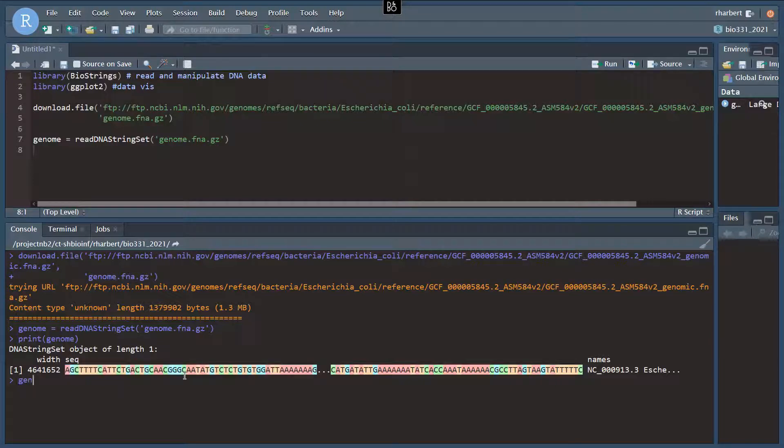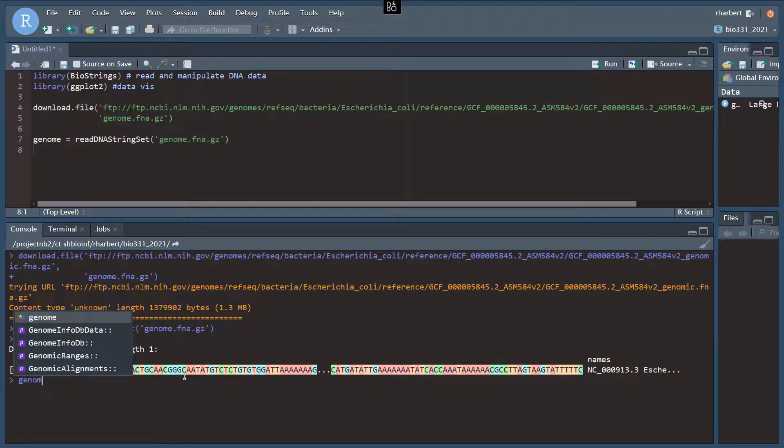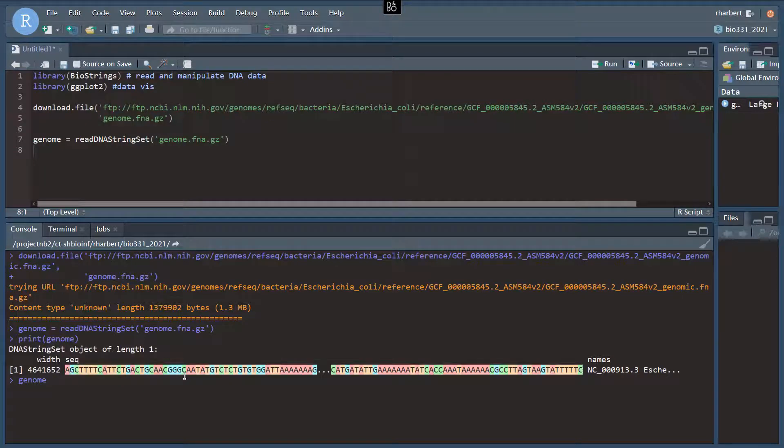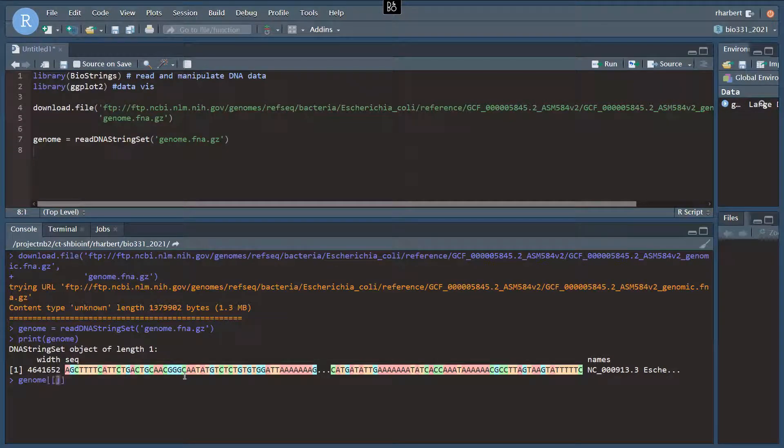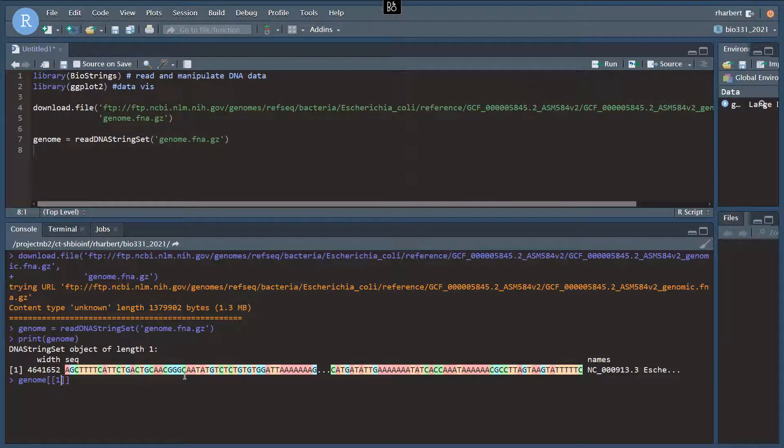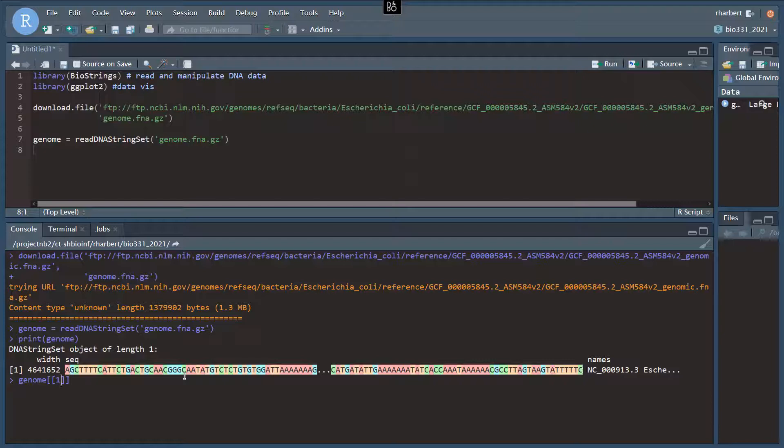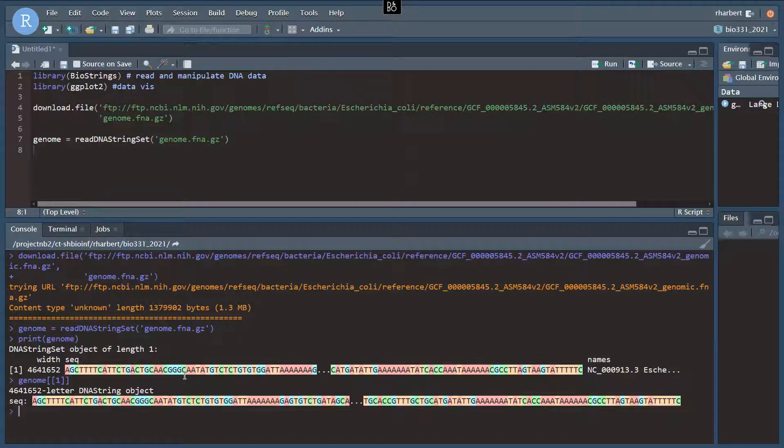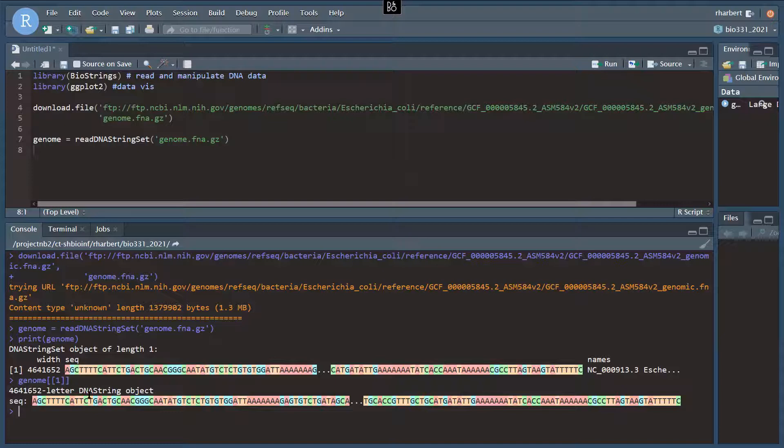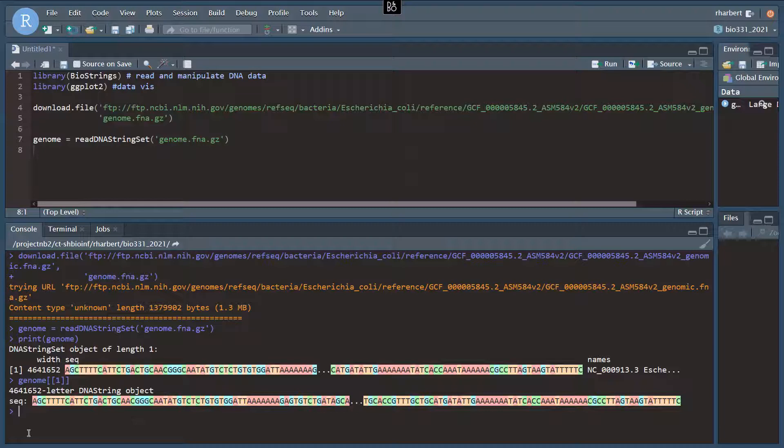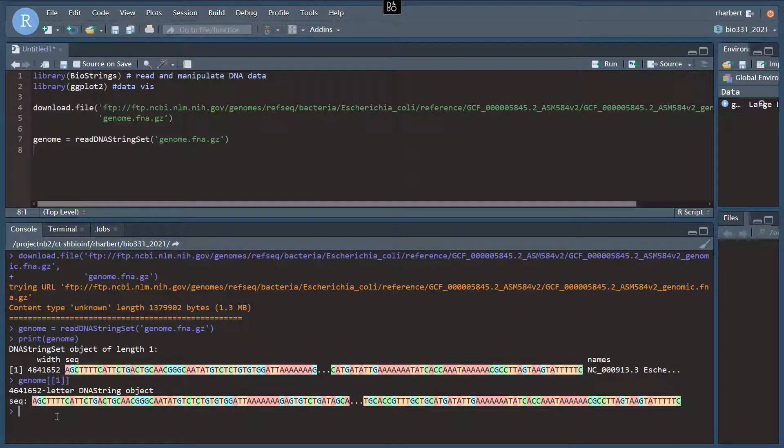We can get just the sequence part of this using the index notation with two brackets in R. So each one of these index values, if there were more than one chromosome, we could use index 1, 2, 3, 4. But in this case, we just have just one. So if we look at that, it says this is a 4.6 million letter DNAString object, and now it gives us just the sequence attribute here, not the width or names part of that.